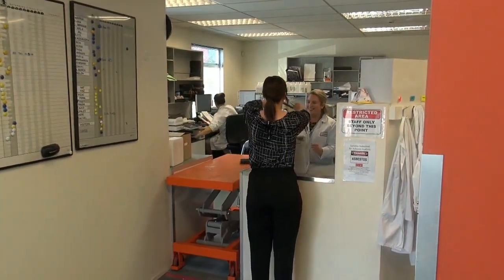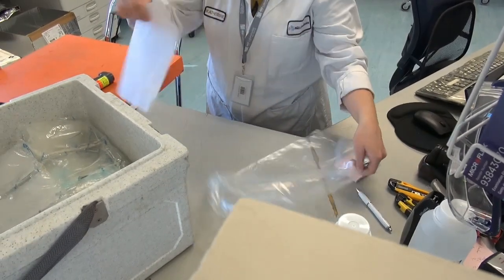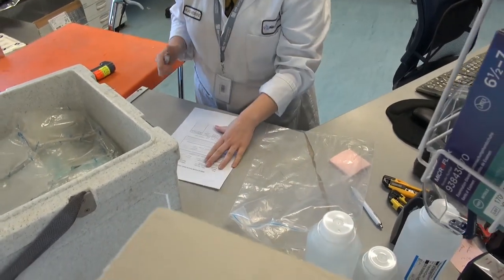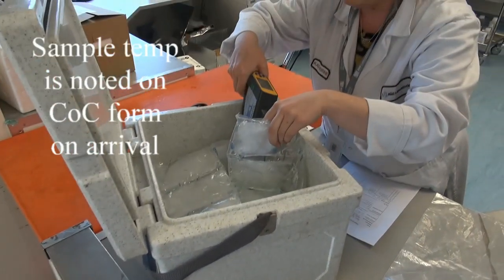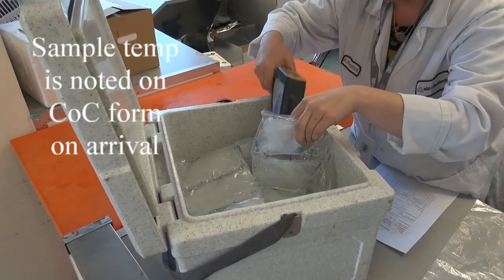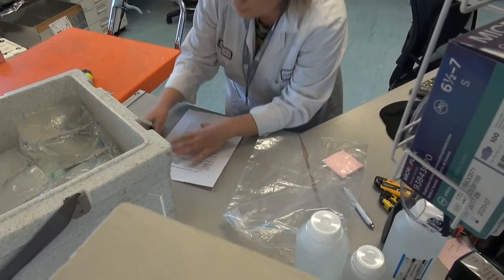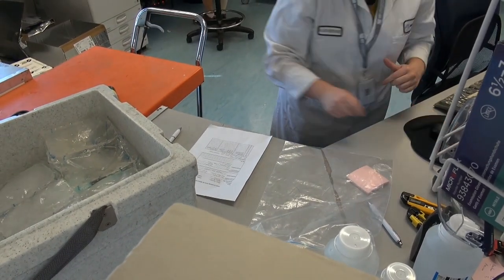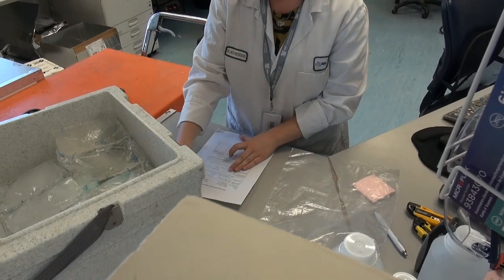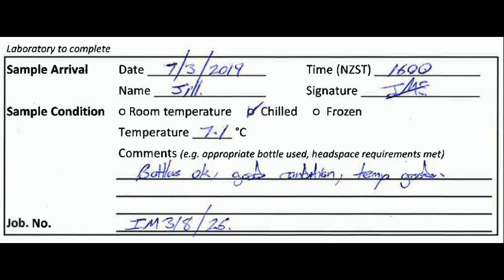And the temperature range you accept for samples is under 10 degrees.